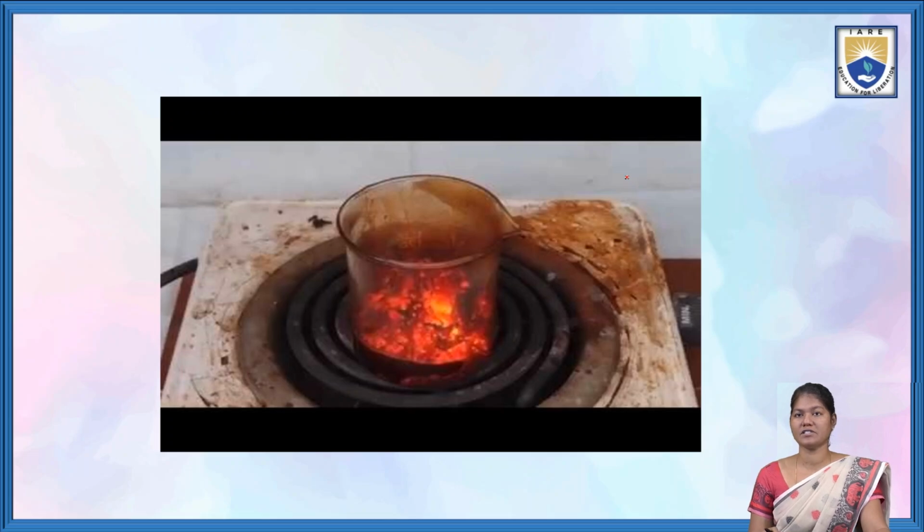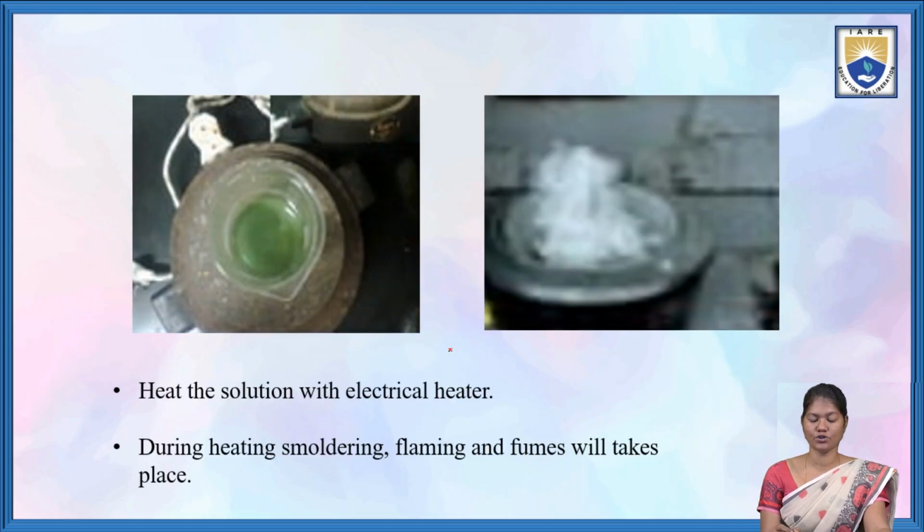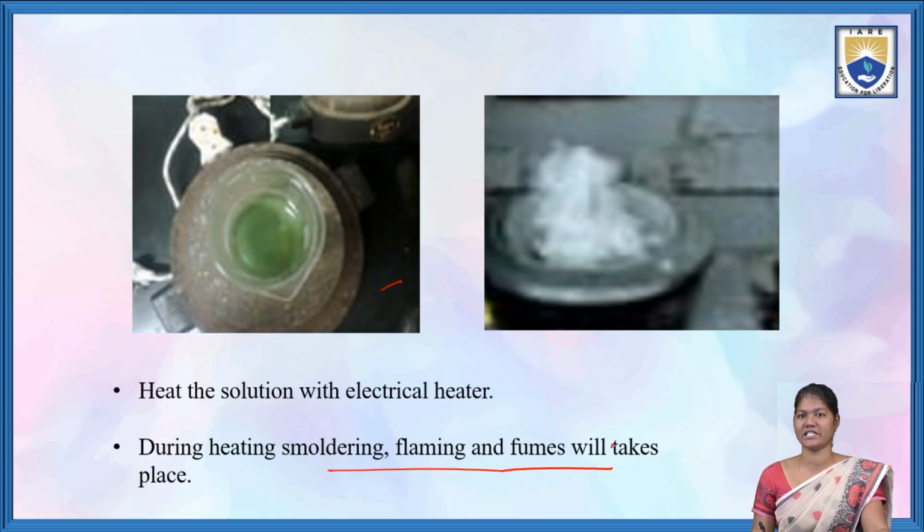After stirring, it is kept on an electrical heater. Heat the solution with the electrical heater. During the heating, smoldering, flaming and fumes will take place.